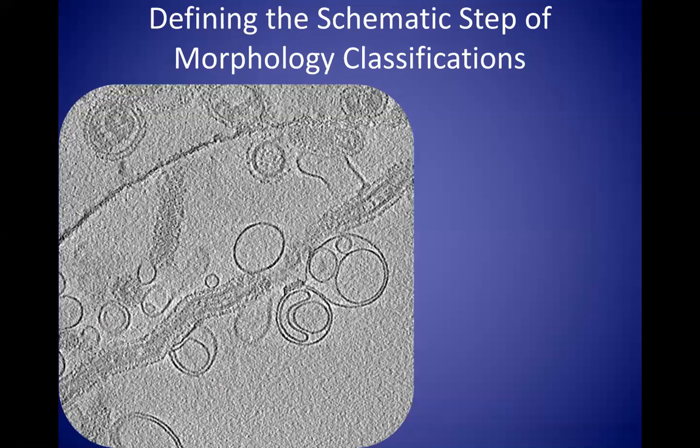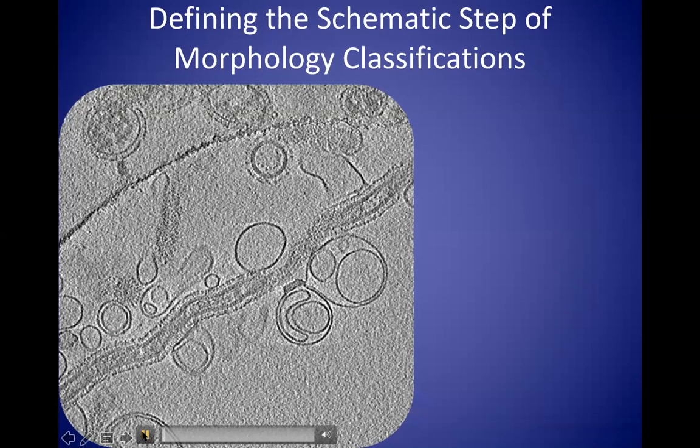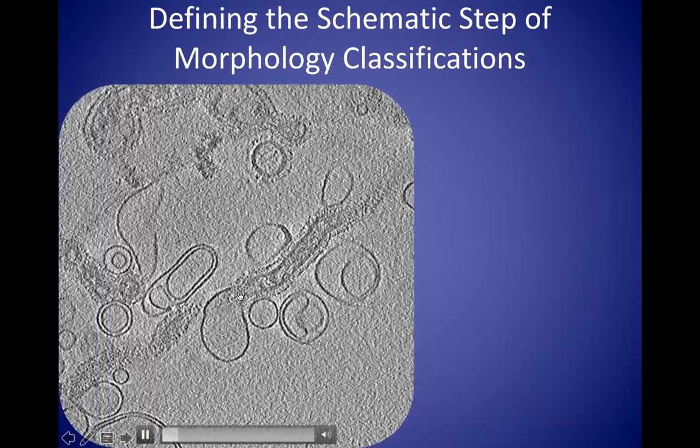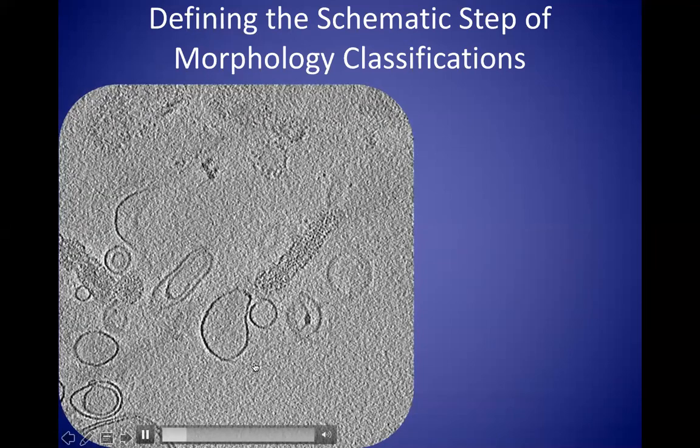And to give you an idea of the power of this, here is one of my influenza tomograms. And so the virus is this long brush-like thing. Lipid vesicles are these smooth circles. And I want you to look at this and try to argue with yourself which of these sites are fusion or hemifusion versus adhesion or non-productive intermediates. And so we do have a number of interactions. You can see a very nice sort of flat interface there.